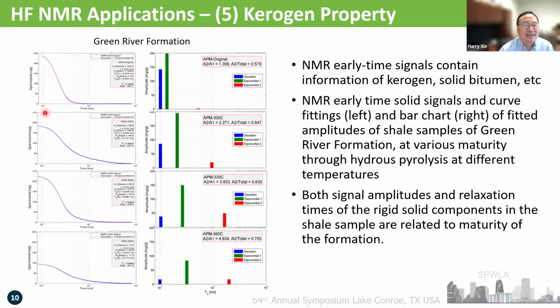But if you look at the data here, this is a decay time. This is supposed to be, if you take this as 0.001 milliseconds to start, it takes less than 10 microseconds to disappear. Let me try to see. This is 0.1 milliseconds, and this is 10 microseconds. So it takes about 20 or 30 microseconds for the signal to completely disappear.